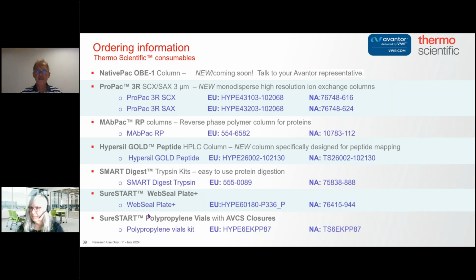For that, you need to take very careful control of the actual capacities of the column. These are measured under the normal standard conditions and the suitability tests, but in general, the monodisperse columns are far more reliable to pack, so they're more reproducible from column to column as well as batch to batch.